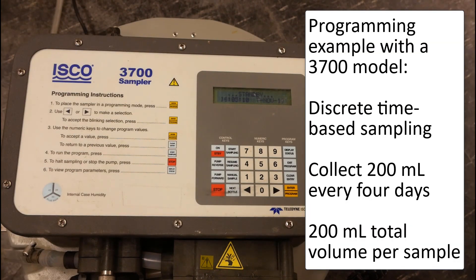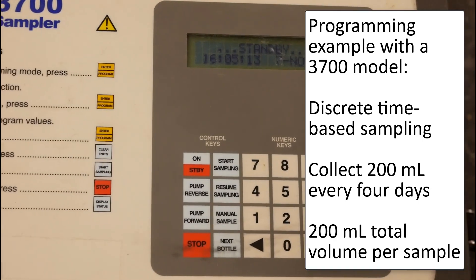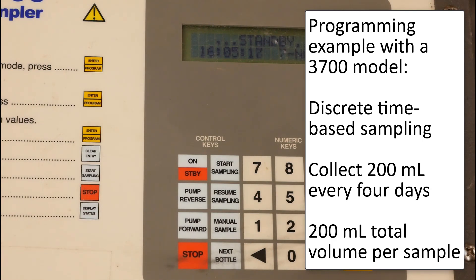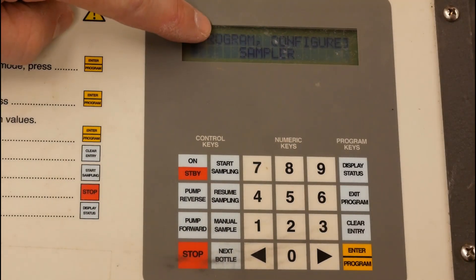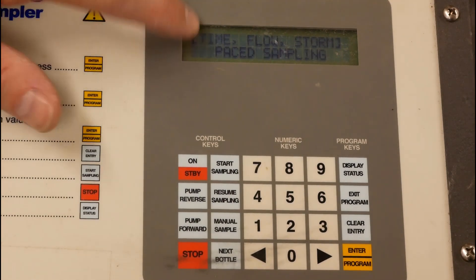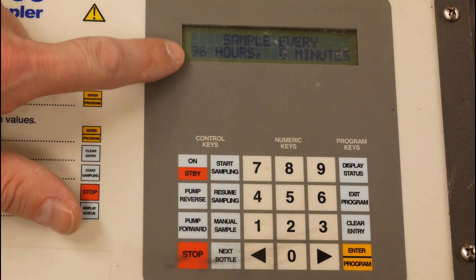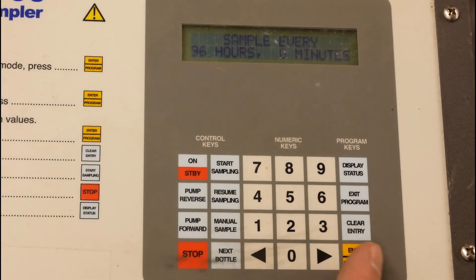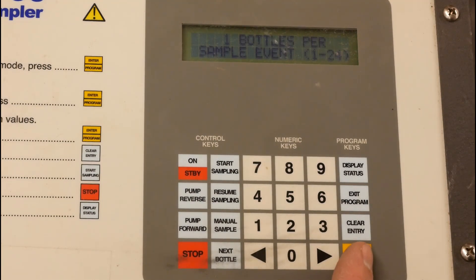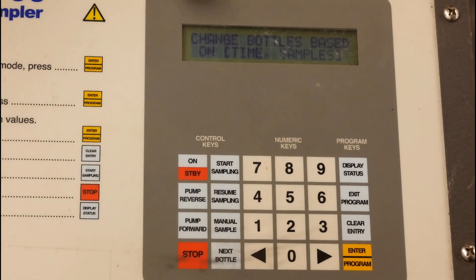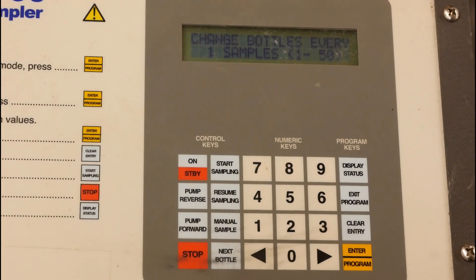This next section covers programming a 3700 Teledyne ISCO autosampler, which does not have a flow sensor or pressure transducer attached, so we'll do only time-based sampling. We select time-based, uniform time intervals, and set it to sample every 96 hours and zero minutes. We have one bottle per sample event, and we'll change bottles based on samples collected — changing bottles every one sample.